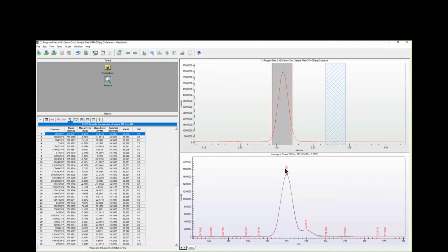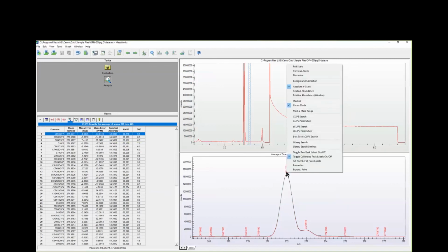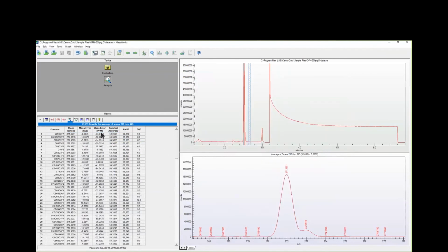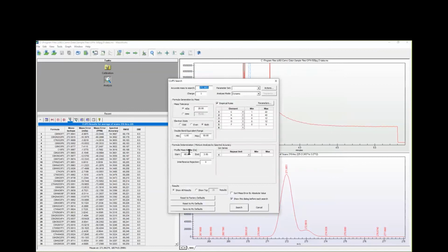Oops. Search. It's weird. Got something set up wrong here. Oh, okay. Yeah, of course.